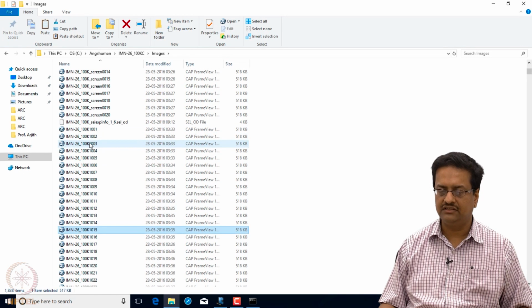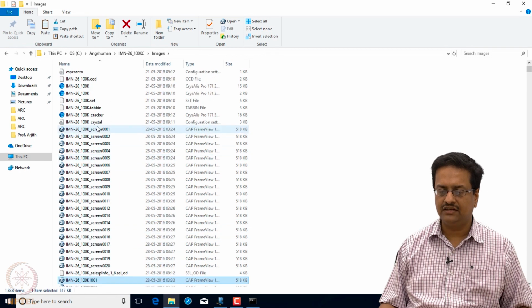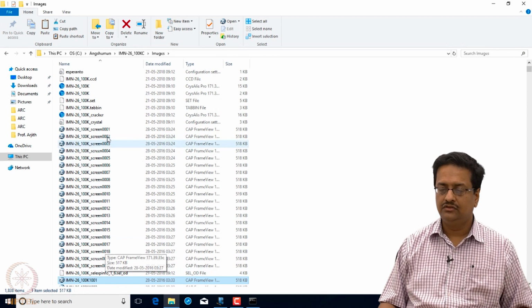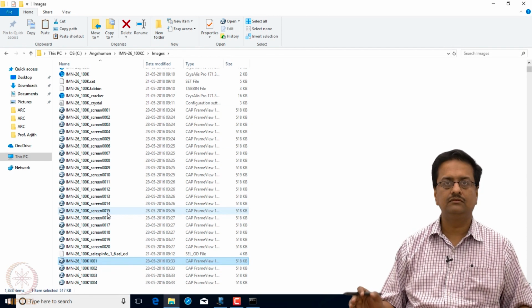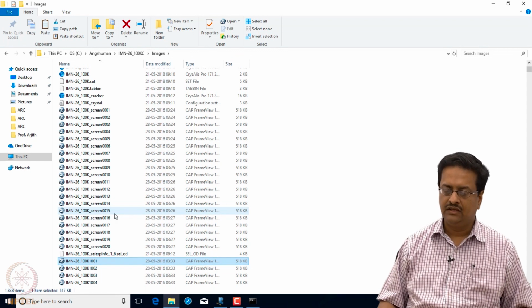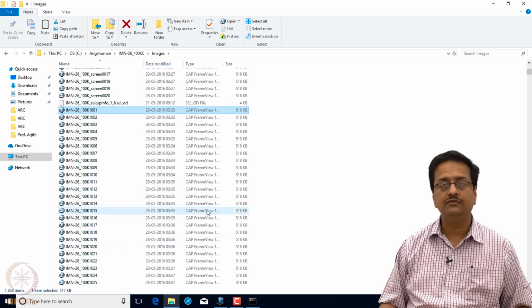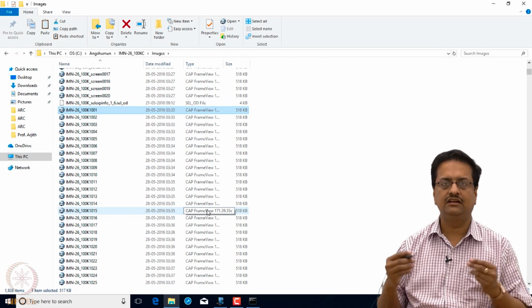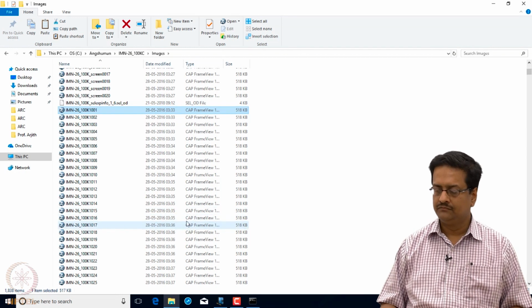These are the images, and if you see, there are some file names which are written with screen 001 to screen 020. These 20 images are used to do the indexing at the beginning, and then the data at the bottom without any screen information is a frame view, which means the digitally captured image of the X-ray diffraction data for every frame.